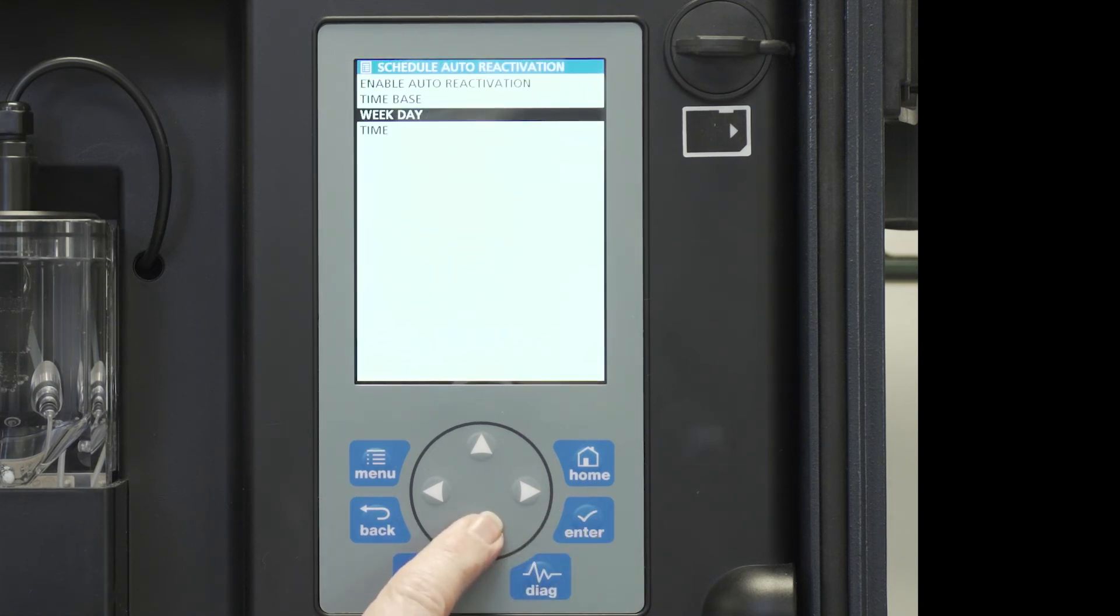At time, we want to have the reactivation at 1 o'clock in the morning on those days.